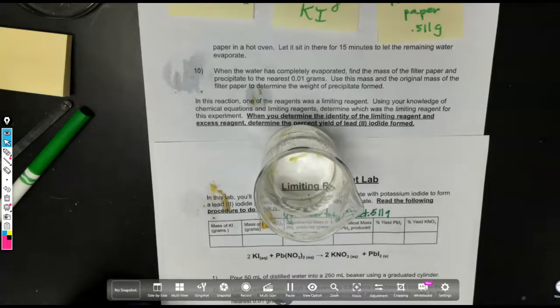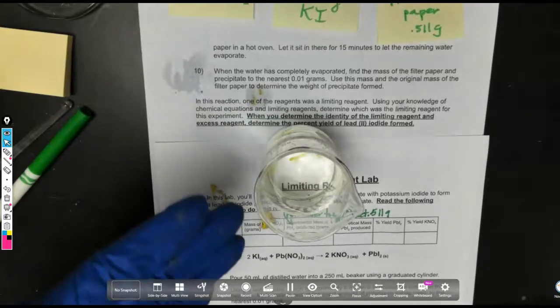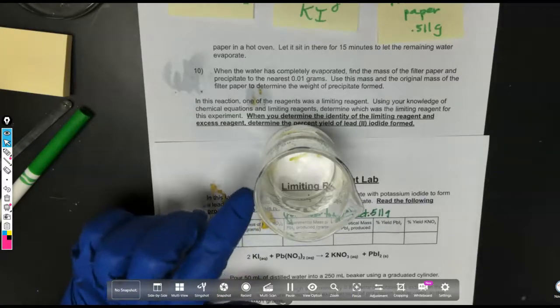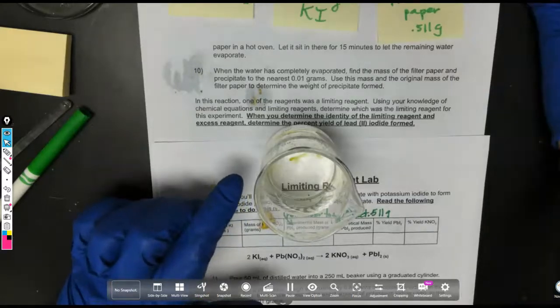So to be able to get this separated, we need to use a different physical means of separation that is not filtration, because obviously there is nothing to filter. Instead, we are going to use evaporation. And so we are going to evaporate this solution to dryness using something called an evaporating dish and a hot plate.